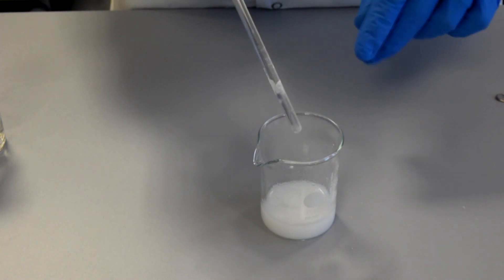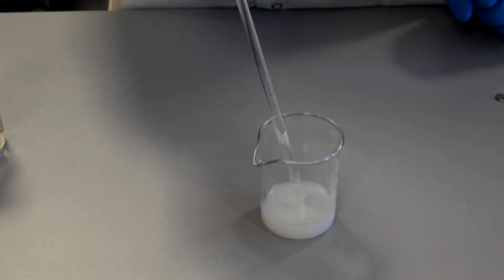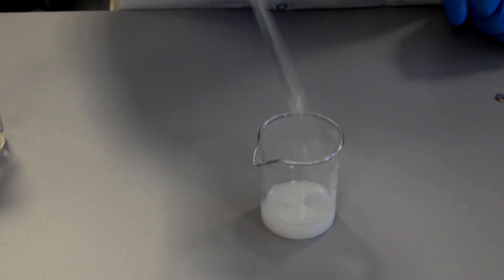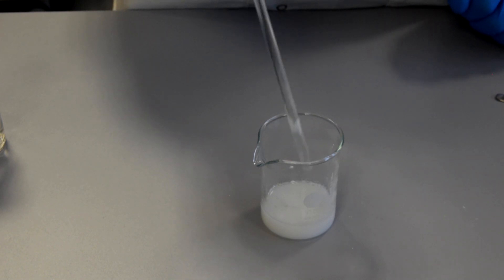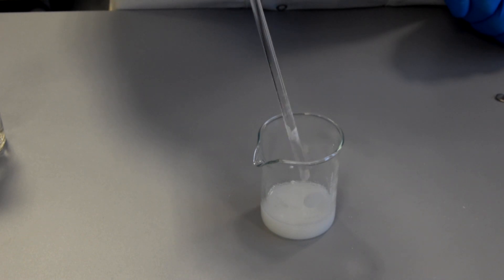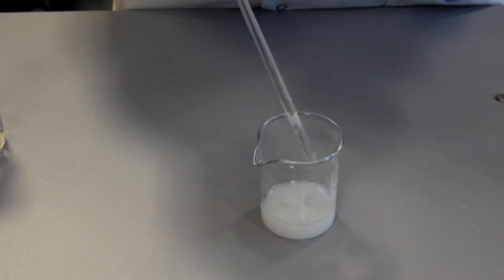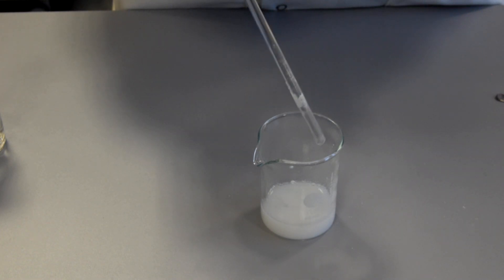Because this magnesium carbonate is insoluble, that makes it easy to separate the excess magnesium carbonate by just doing a simple filtration. The next stage is to carry out a filtration to remove the excess magnesium carbonate, which should just leave me with my magnesium sulfate solution.